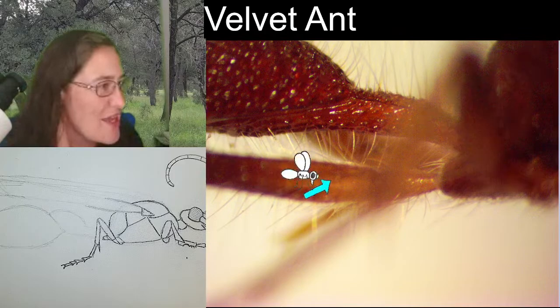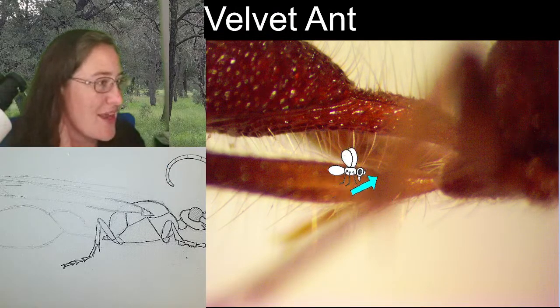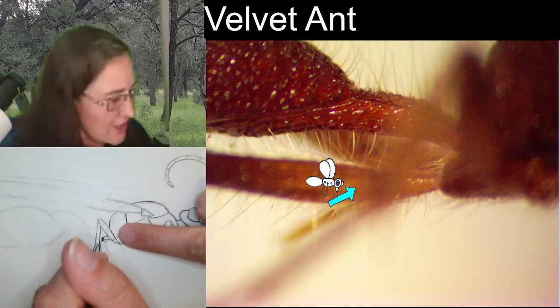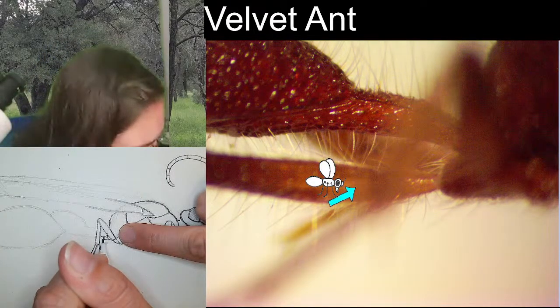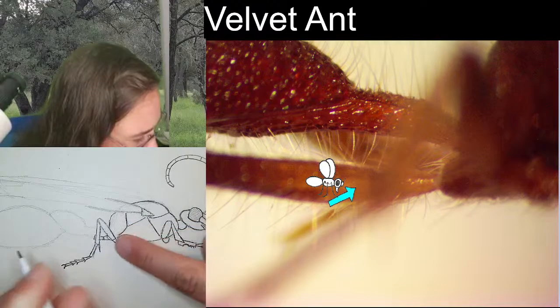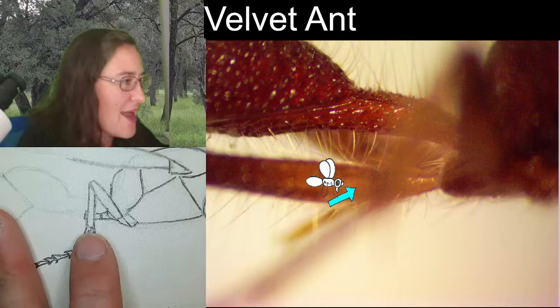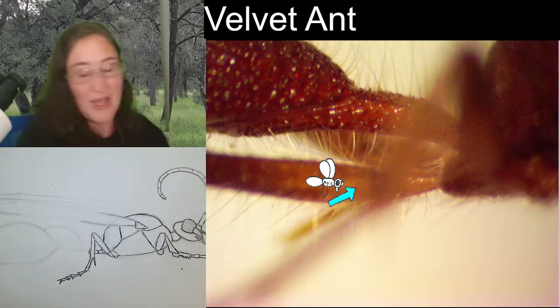This line coming down through, this kind of foggy line coming through, that's the middle leg. But this going out, that's the hind leg. So this triangular piece here is the trochanter. Kind of comes out like... So, and it's going to be pretty much directly behind that leg, but I have the ability to kind of start it, so might as well.